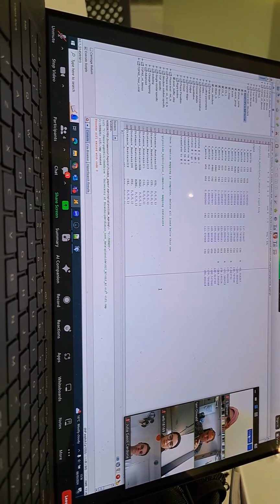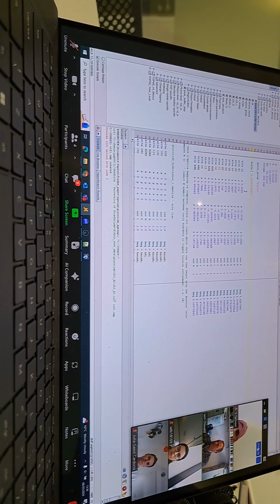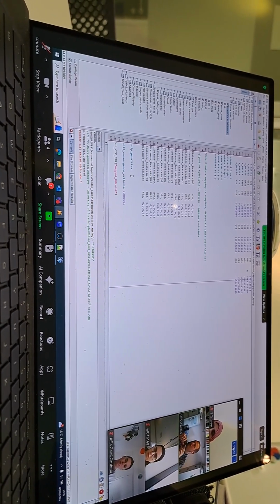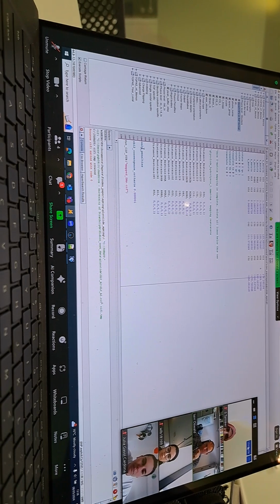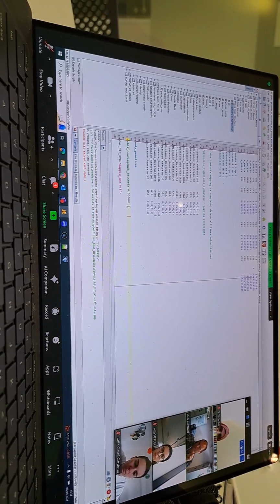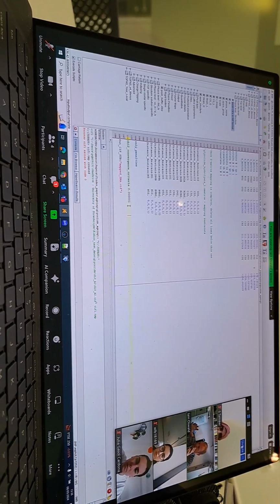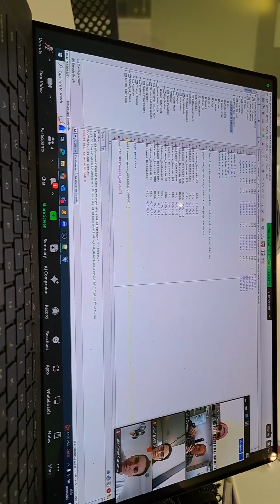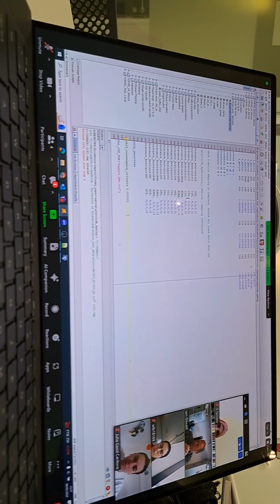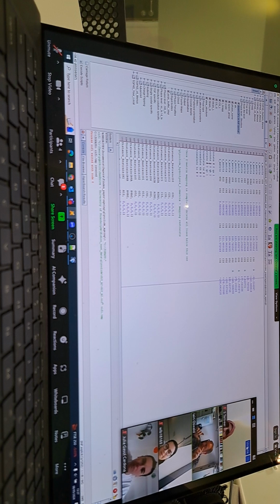Now, we need to be sure that we're not refining anything else while we're doing this, okay? So it needs to be a command that is only looking at penalties. So it's always trying to get to the minimum. So these instructions down here are important. Okay, the only penalties in convergence. Essentially, it's just going to go and there's no refinement of anything. All it's doing is just minimizing the difference between these atoms here, and that's all it's doing. Okay, there's no refinement per se. The only thing it's refining is maybe the rotations and the translations. Okay.